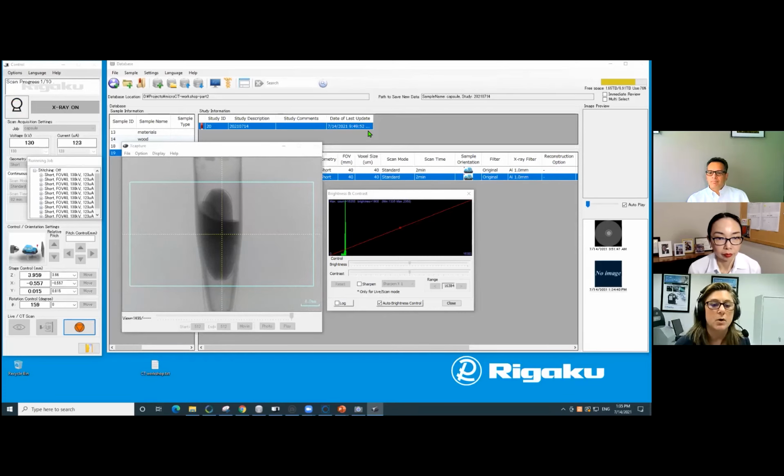Okay, so normally there are a number of artifacts we can certainly correct for. Like for example, ring artifacts. They're usually caused by a dead pixel on the detector. And so it's very easy to get rid of them with this instrument because you just move the sample as you're collecting, and then that fills in those areas where the data is not measured. There are also some tools you can use during reconstruction to remove those. Metal artifacts, there are special corrections to deal with those during reconstruction. And as a matter of fact, many of them, that's when and where they're handled.